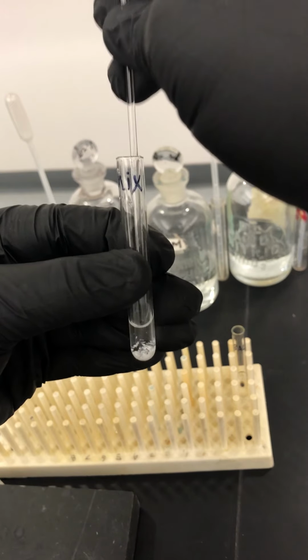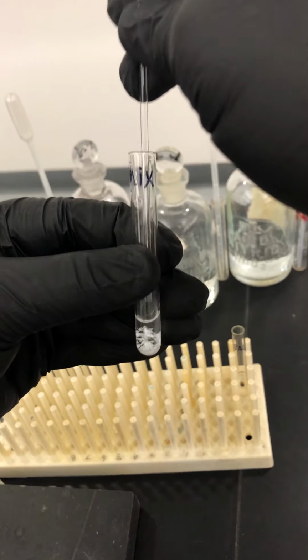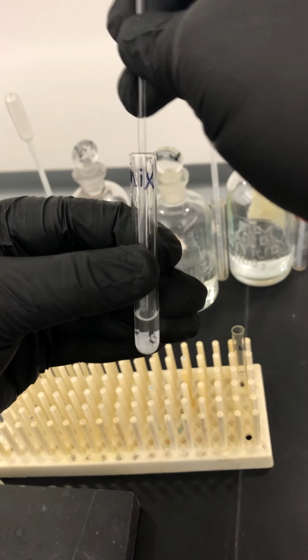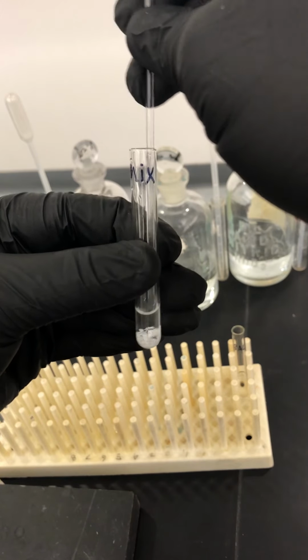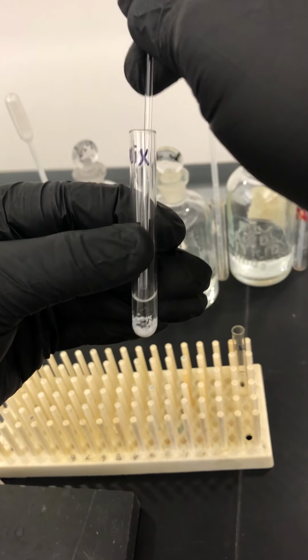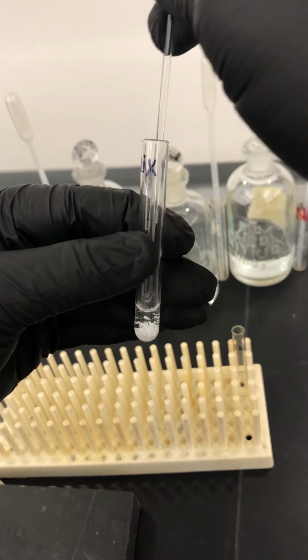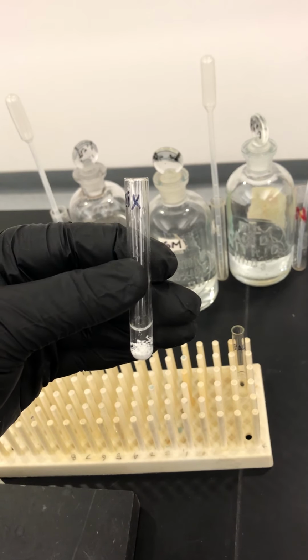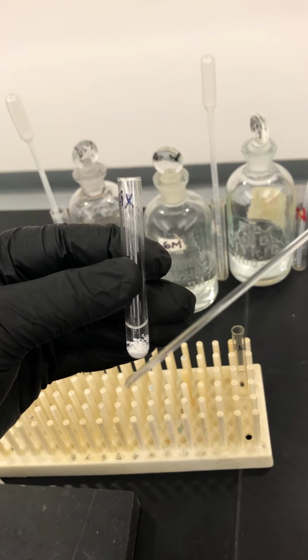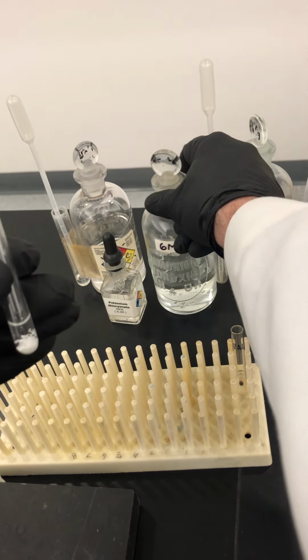Again, remember, when you do this, all you're doing is a physical change. You are just causing the pellet to separate into very small particles. This is not dissolving, okay? This is called suspending the precipitate. I just want to make sure that it's all in smaller particles. I'm going to take my stir rod out and put it with the other used glassware in a container that we have for that. And now I'm going to bring in my ammonia.